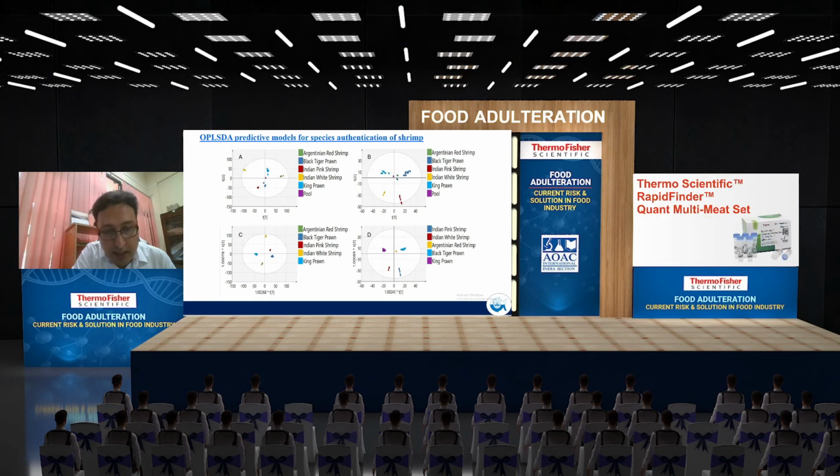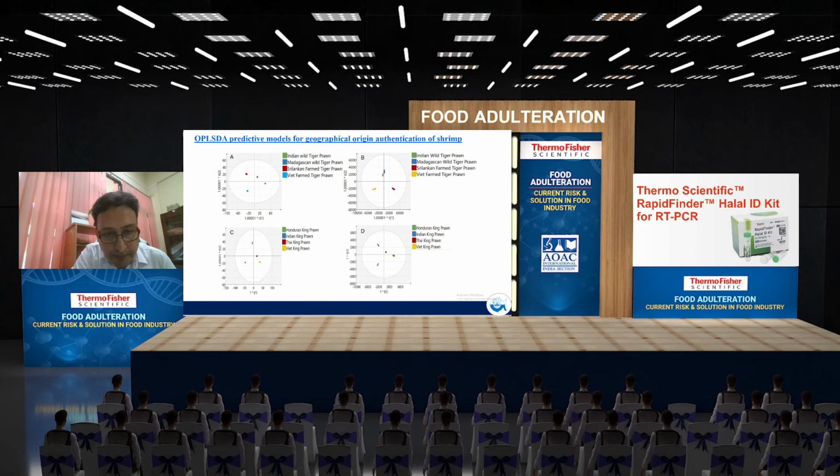But again, as I told, identification of markers is very important, because you cannot employ this LC-HRMS based method for regulatory control probably, because there will be variation in the mass accuracy and slight fluctuation in the masses of those particular ions. So it is very important to identify the biomarkers to have a regulatory method. May I have the next slide, please?